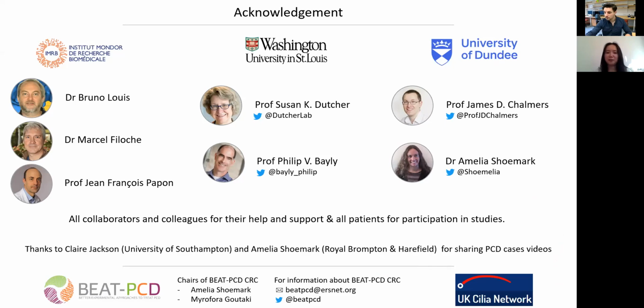Great. Thank you very much, Mathieu. It was a very clear presentation with examples of reduced and normal beating patterns. We have the first question from Ayed. He asks, how does the angle of view dictate the output from the FFT calculation, and does the angle not matter in this case?